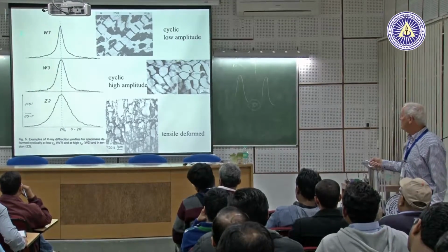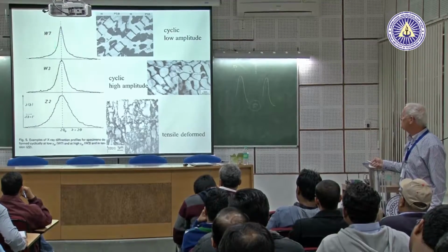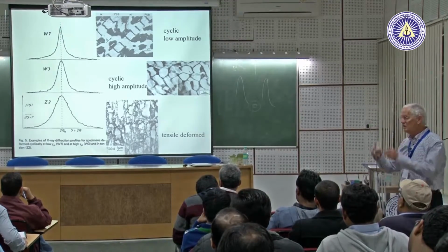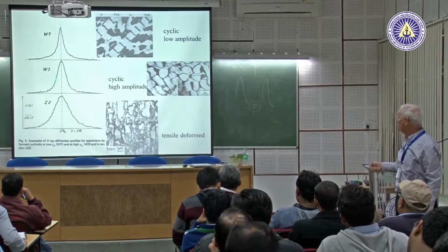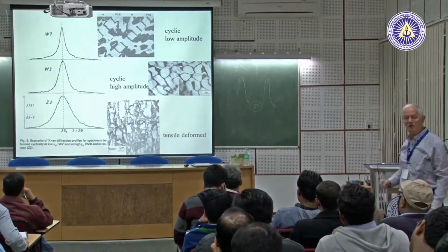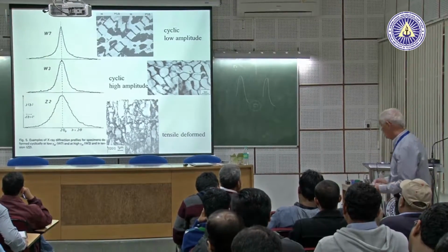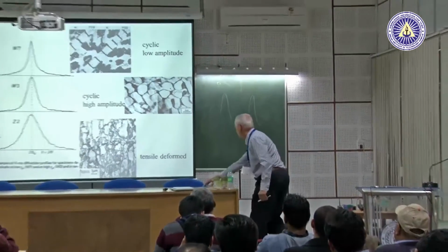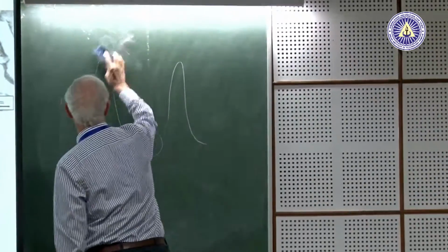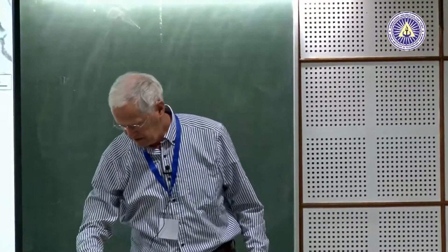You see, this shape is somewhat, this peak is pointed upwards. It is like that. The other one is more bell-shaped with a shorter tail. Okay? So if we would put them together, then the difference would be, I'll show you that.